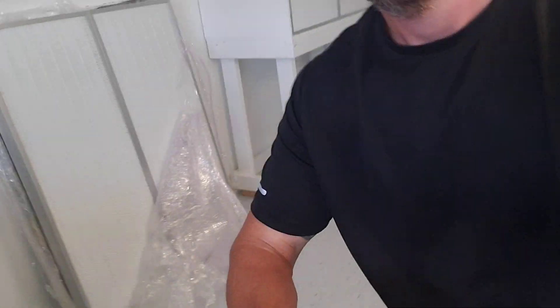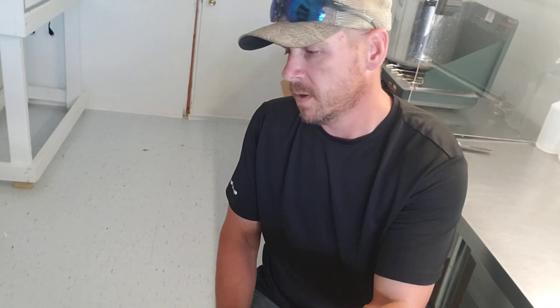I have paint on the walls — my favorite Sherwin-Williams pre-catalyzed epoxy. It's rock hard, waterproof, and cleanable. Everything in here is sealed up. I put quarter round in all the corners and caulked everywhere, so this room is completely sealed up. I caulked the seam where the drywall meets the floor. I put stick-on tiles — not ceramic, but they're cleanable, washable, and chemical-resistant for bleach, because you're going to be cleaning this room a lot.